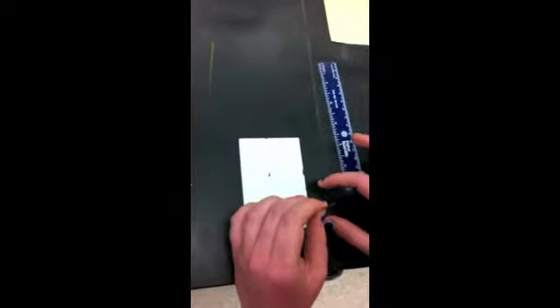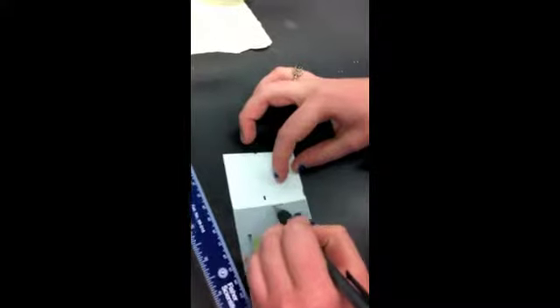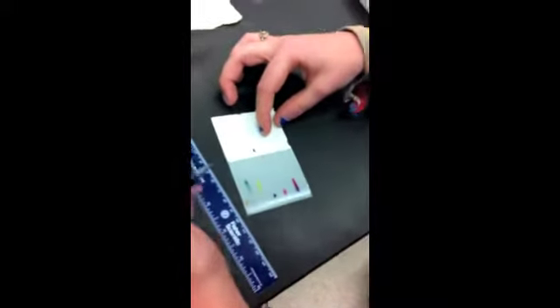After all of your known dots, you take your unknown dot and, using the capillary tube, place it on the TLC card. And then we're going to put it into the water solution and let it sit for 10 to 15 minutes. So now I'm going to draw my solvent line, and circle each of them so you can show them in case they fade.